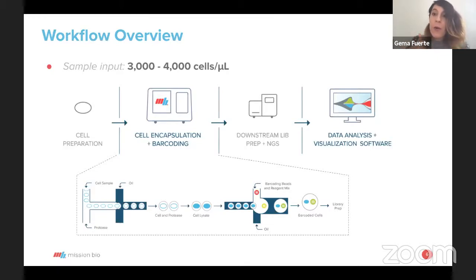So if you are working with acute myeloid leukemia, you will have your panel, all the amplicons, all the reagents will be there in that picoliter PCR reactor, and then overnight, you will be amplifying all of that at a single cell level.